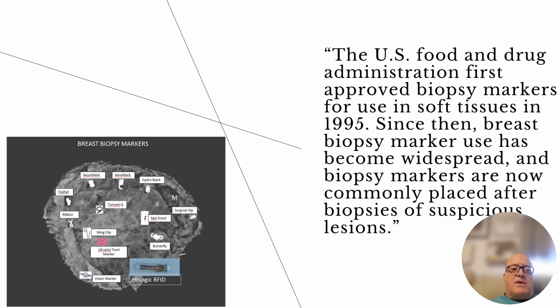In the bottom left corner is a radiographic image of a mastectomy, and I've copied and pasted the variety of markers out there and the names of those markers. These markers have been utilized in soft tissue tumors and also predominantly breast cases since 1995.